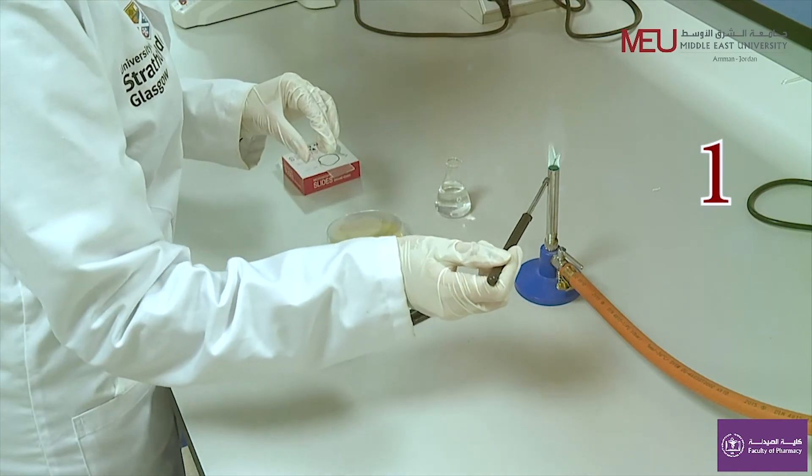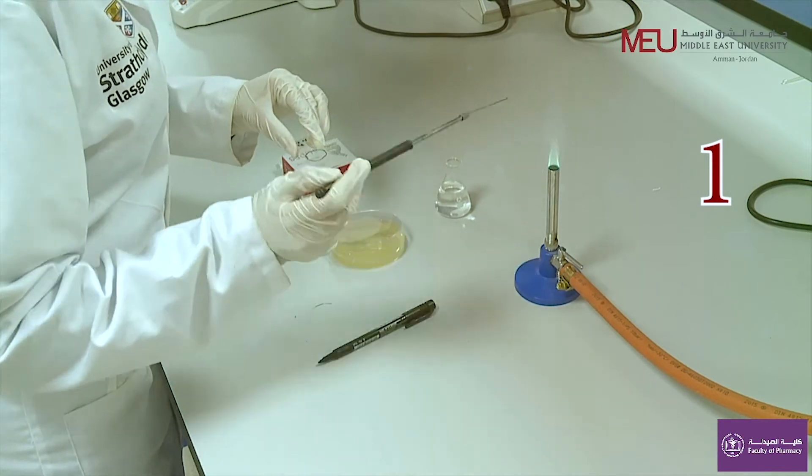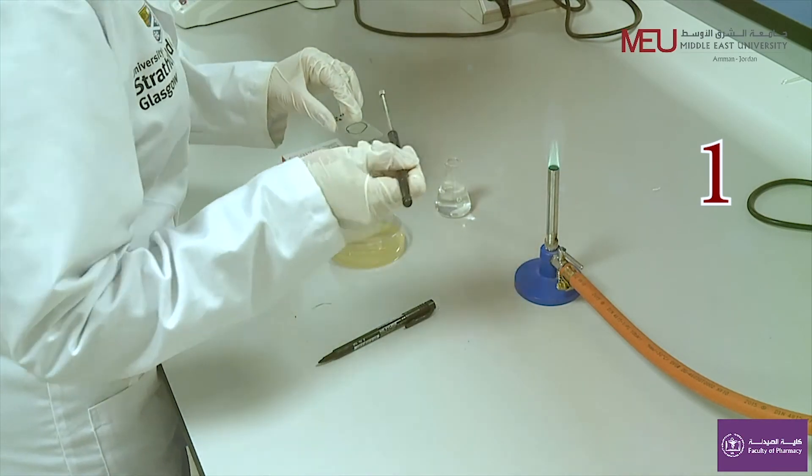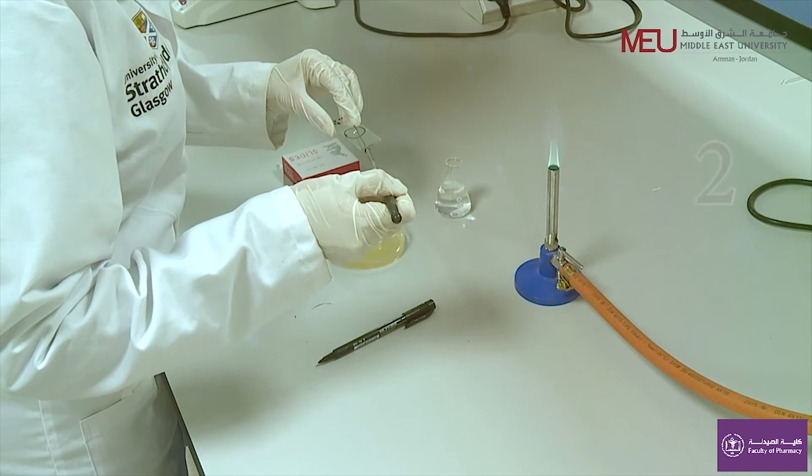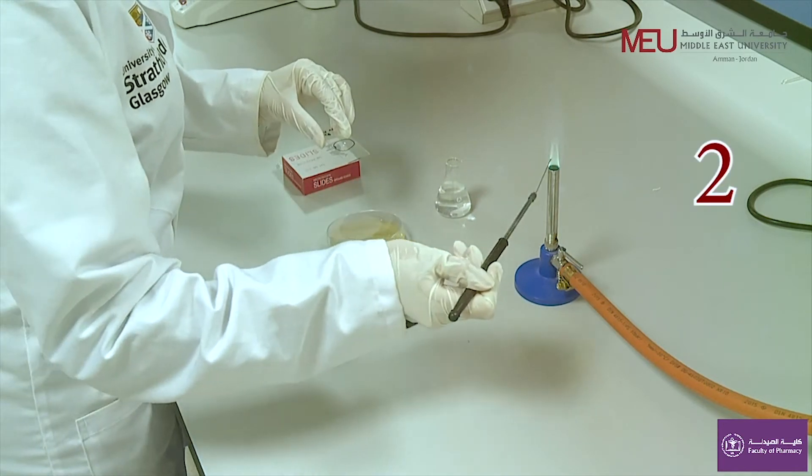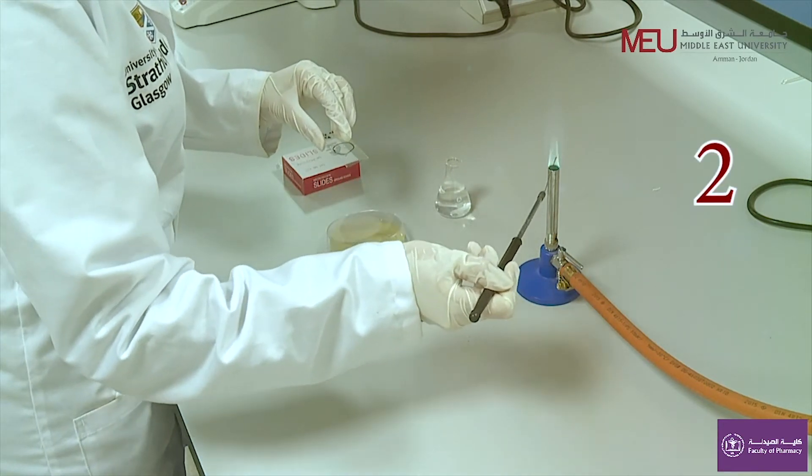Sterilize the loop and place a small drop of water on the slide. Then sterilize it again and scrape and transfer a loop of bacterial culture to the drop of water.